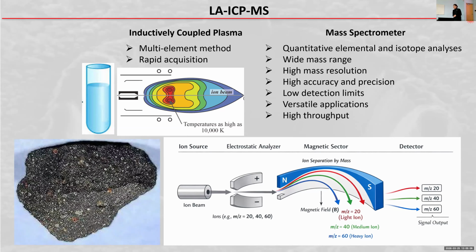Now, if you have rock samples, for instance, like us geologists, you have to undergo a lot of difficulties to get this rock into solution. It requires a lot of harsh acid treatments, and a full lab infrastructure, in order to make good use of the very great signal to noise property of a mass spectrometer.